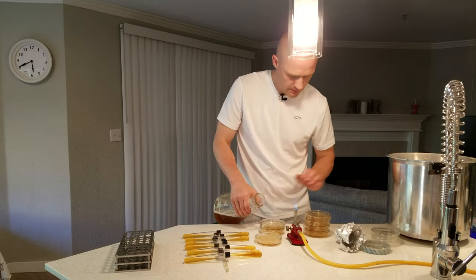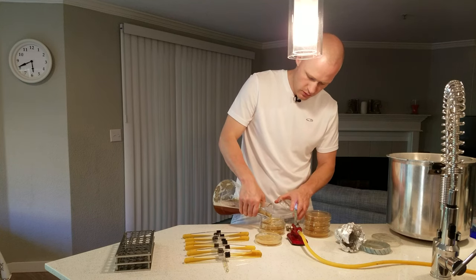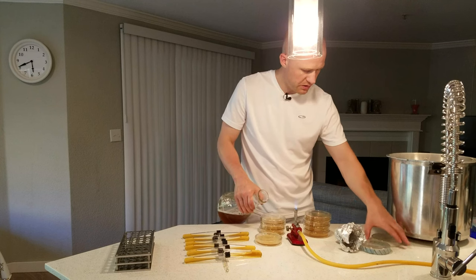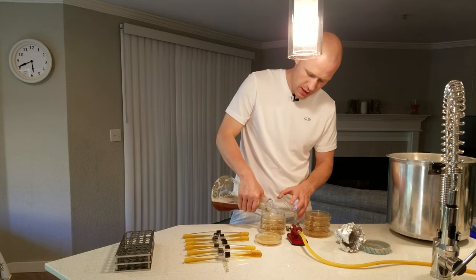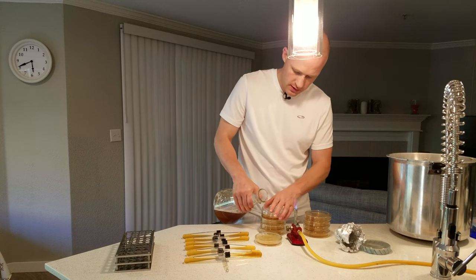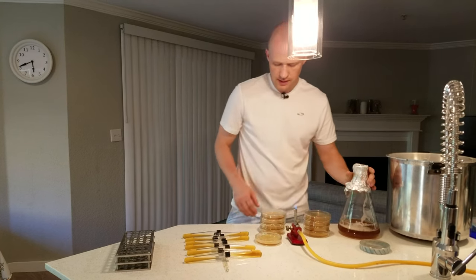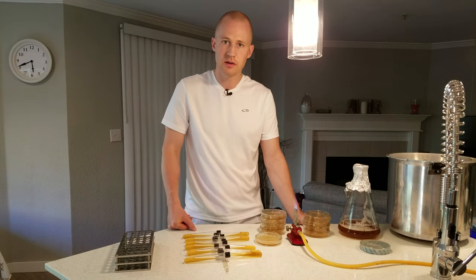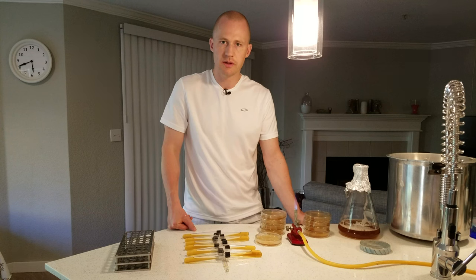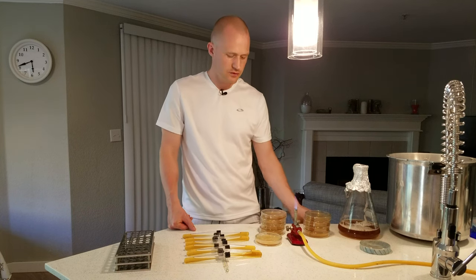We're going to leave these out here until they solidify. Once they have solidified, we'll put a rubber band on them, stack them up, and put them upside down in a warm area — it's about 40 degrees. Leave them there for a couple of days to have all the condensation go off. Then we'll tape them up with either electrical tape or chem tape that you can stretch around it.